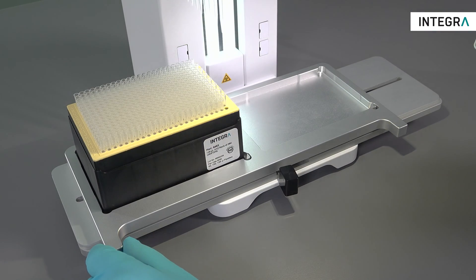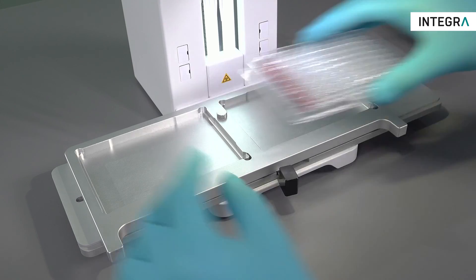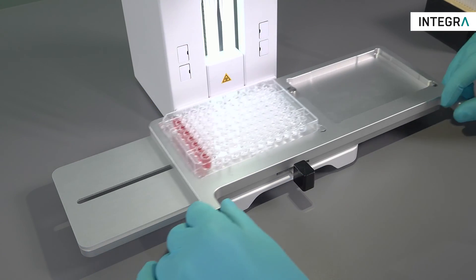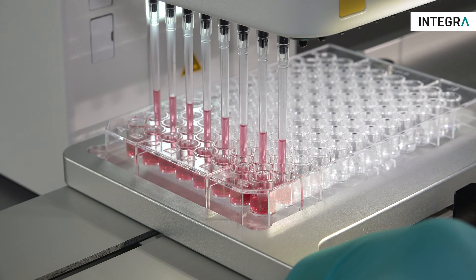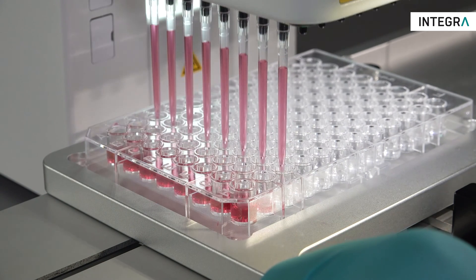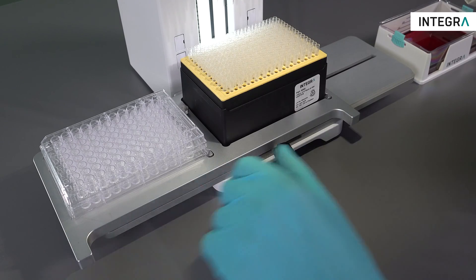As an option, a two position stage opens up even more possibilities for use with the MINI 96 — for example, using the instrument as an 8 channel pipette for serial dilutions or other intraplate applications, or filling partial plates. The two position base can be used as a second position with all 96 tips loaded, if so needed.